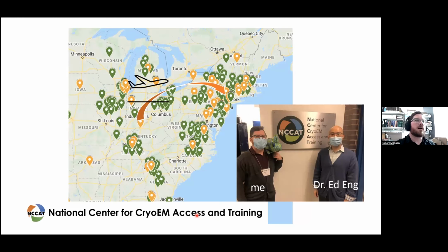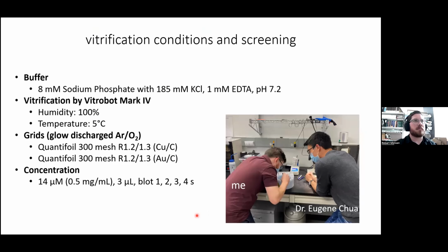And so, of course, we don't have any cryo-EM facilities at University of Louisville in Kentucky, but I reached out and found that the NCCAT group, at the time, had general user proposals that I could apply for and try to do grid preparation and screening and all that. And I even did a grid making course when I went out there. But yeah, this is me and Ed. And so I took my samples out, and Eugene kind of showed me the ropes of cryo-EM preparation, screening and analysis.